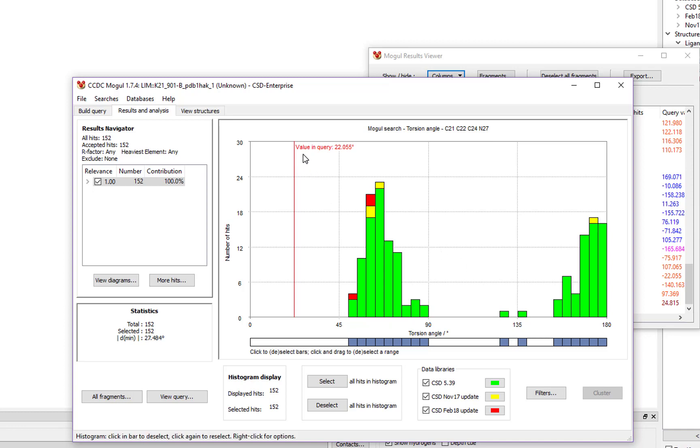You'll see the value of our query, which is given by this red line, falls well outside the histogram of expected values from the CSD. So we know that this torsion angle is quite unusual to what we would expect.